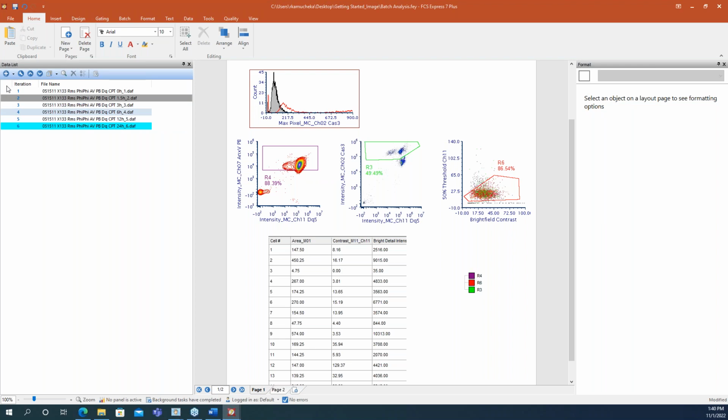So just a quick visit, because we're going into batch processing in this template, is these iteration numbers can be very important. So you saw this one had already been set to a control for this initial histogram where I added the overlays, but 2 places where these iterations get grayed out or deactivated is usually in our spreadsheets or using histograms and overlays. And what that means is the software is trying to remember a pattern, and once it gets to a place where it can't repeat that pattern, so if I used data file 1 and 6, when I got to 2, because there's no 7, all these data files would be grayed out, just because there wouldn't be a data file there to keep that same pattern.